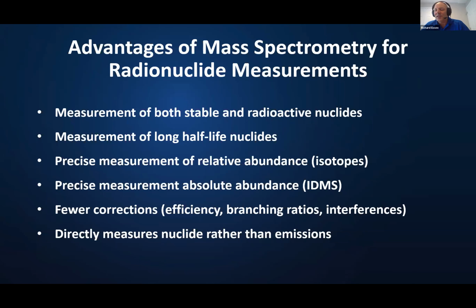And I think it's fundamental to using mass spectrometry for measurements of radioactive nuclides is the half-life, and I think in many cases we need more precise determinations of half-lives, which is kind of circular because one of the ways to get more precise half-lives is using mass spectrometry to get at some of these amount values. And another aspect of that is making these half-life measurements with real clear traceability chains.